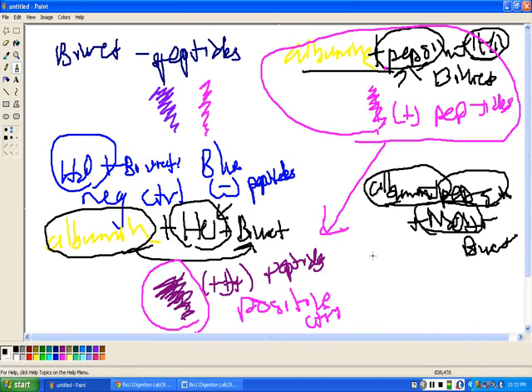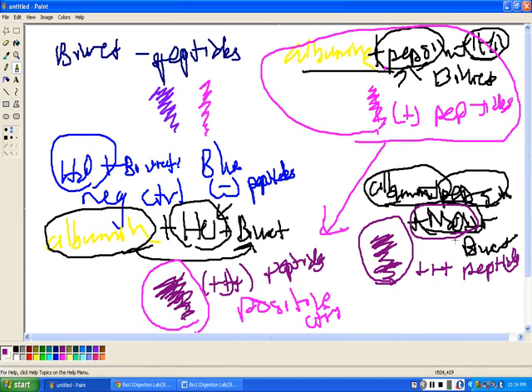Unfortunately, I think a lot of us, when we tested it out, weren't able to actually see that. But if that was the case, we would have expected it to still be a bigger polypeptide chain, since pepsin would not be optimally functioning, so it won't digest the albumin as much. So it's going to be very positive for peptides. It'll be pretty much undigested because the pepsin is not working as well due to the high pH of NaOH.